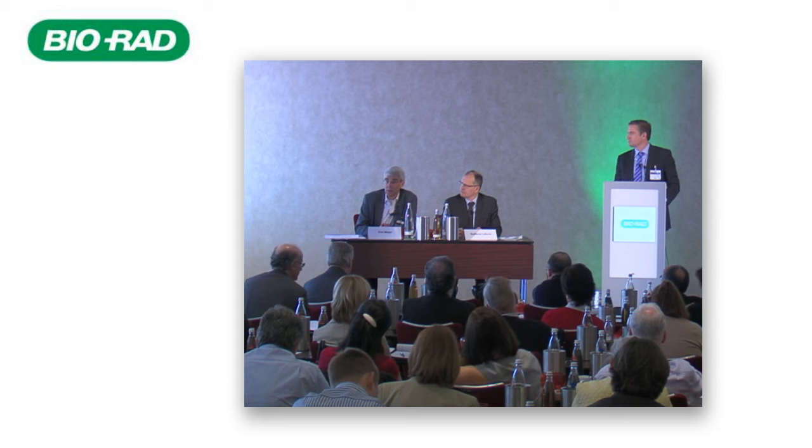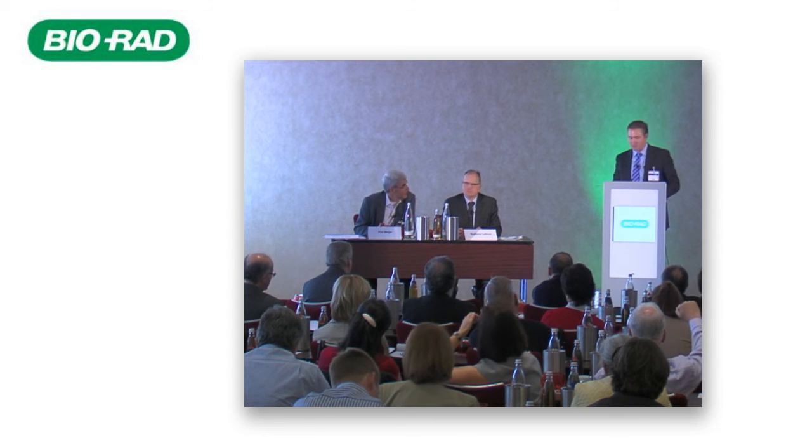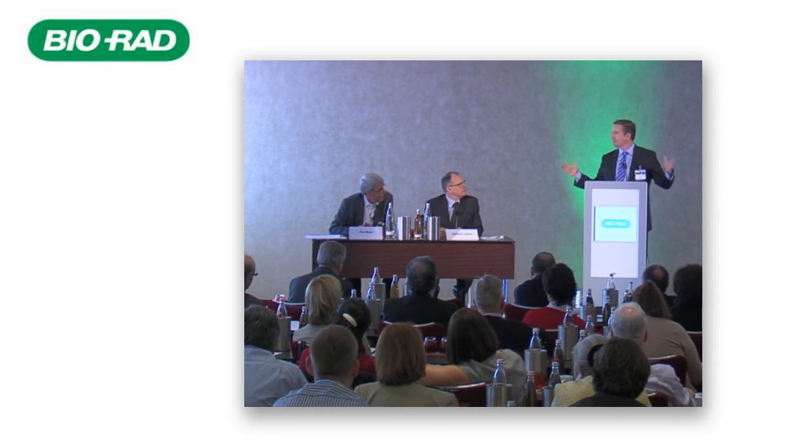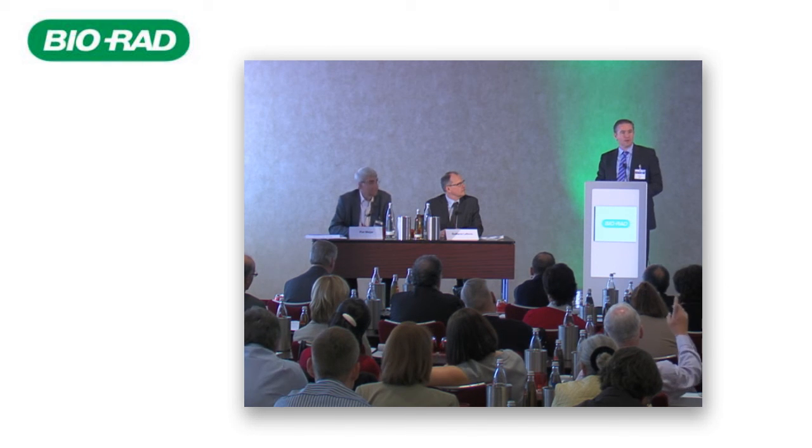I was very encouraged by the concept there, and it brought me back to the very first session this morning, where Dr. Goldschmidt said QC providers can think about expanding into the pre-analytic and post-analytic and things like that. So as you're talking about the entire testing process, it's a novel concept. I know that some of that happens in the pathology, cytopathology, and histopathology world, and they're looking at that as well, but it's a little different. So we'll move on to the next.